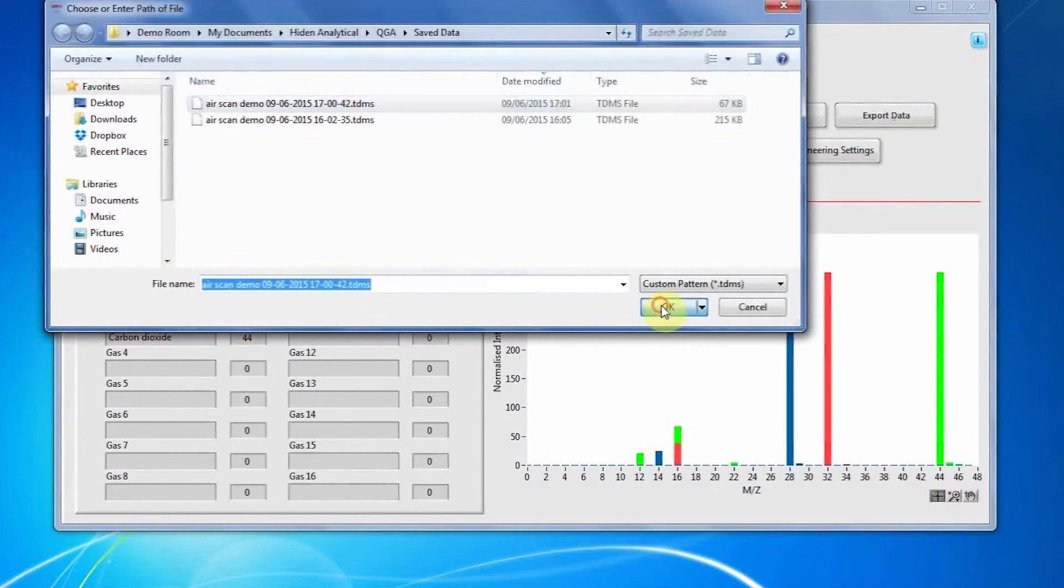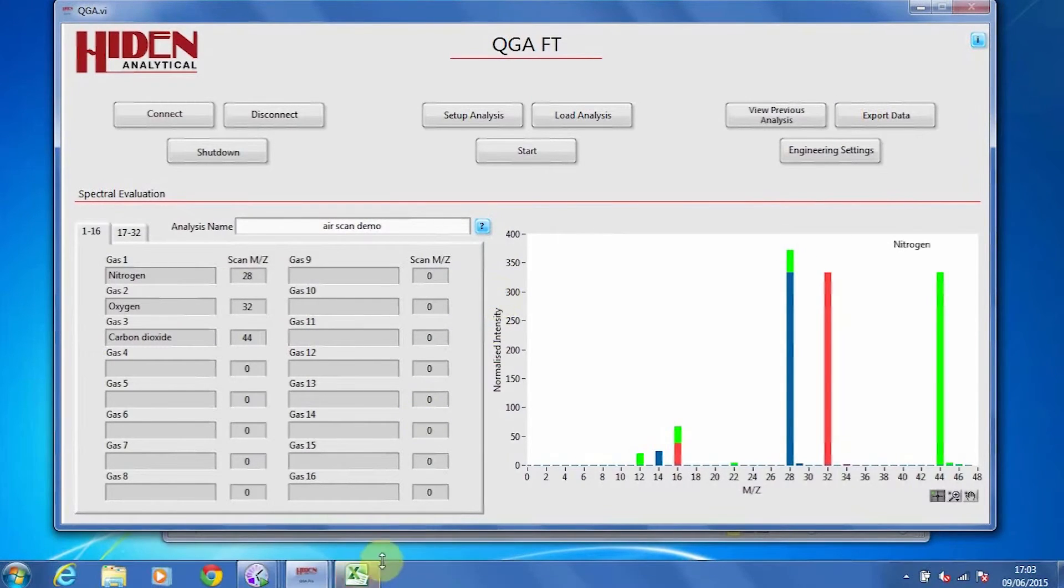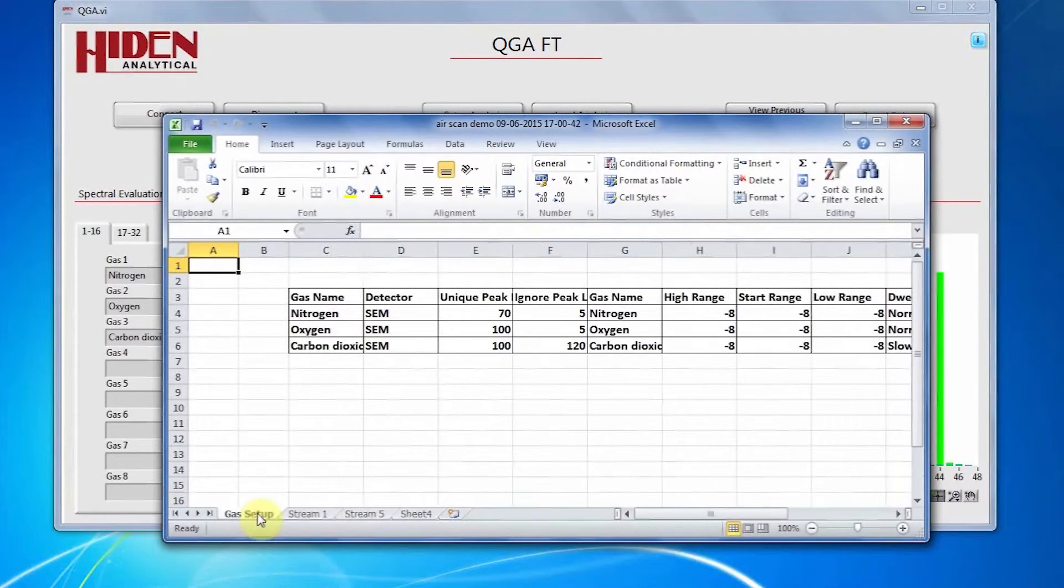The great benefit of the QGA is the number of gases that it can analyze at any one time. A user can select, for example, hydrogen, H2S, oxygen, nitrogen, or a whole range of mixtures, and the onboard spectral evaluator automatically deconvolutes the spectrum and selects the optimum peaks for the analysis.